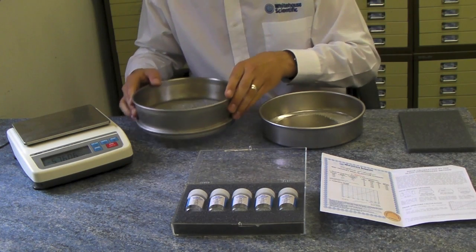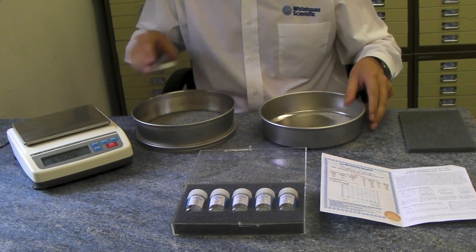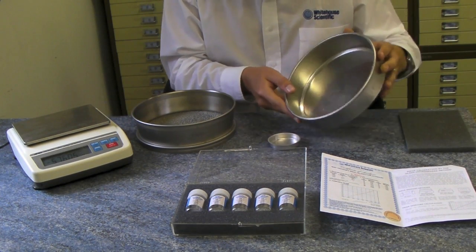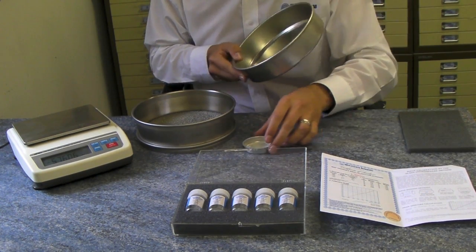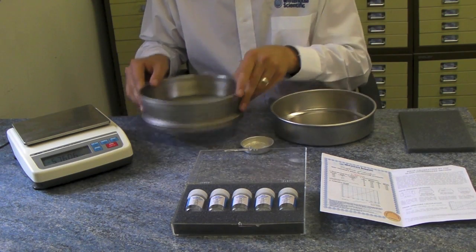Once complete, discard the microspheres which have passed through the sieve. For sieves one millimetre or larger, the microspheres can be returned to the bottle and the standard used again, provided no more than 3% of the original weight has been lost.